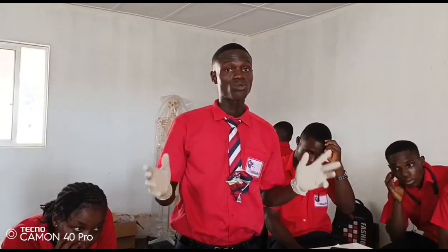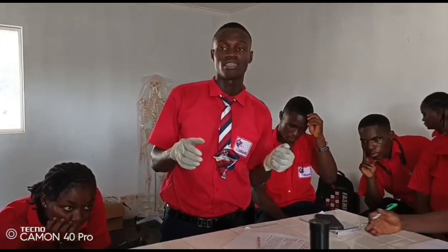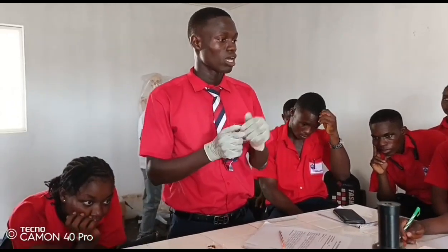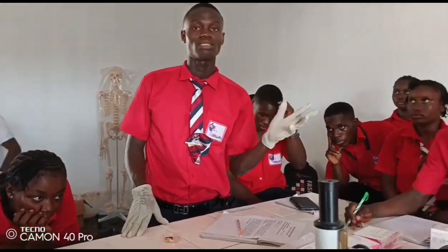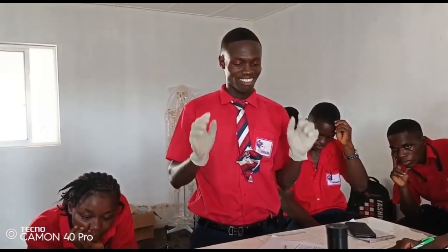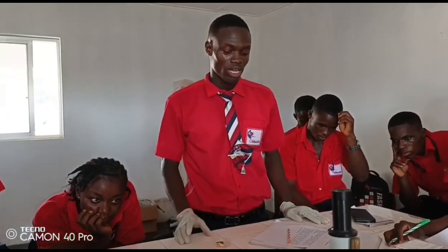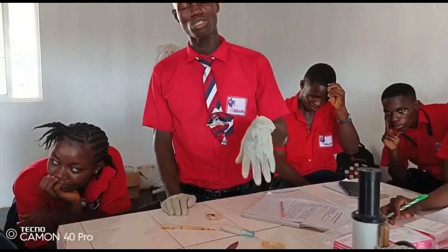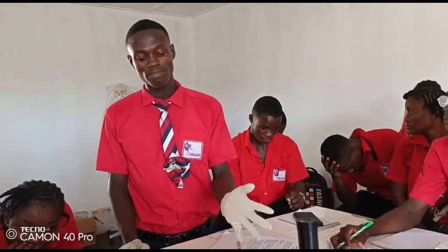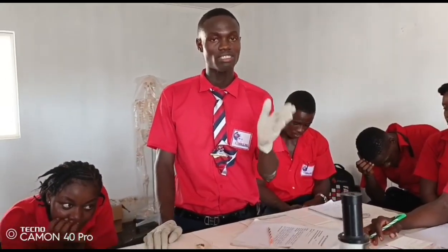My name is Prince Gabo, and today we are in the lab carrying out an experiment concerning fruits to see if they have starch or not. Our teachers told us to bring fruits and food as well, and we brought plantain and other food. Our teacher started the experiment with water, and he placed iodine in the water to see if water has starch or not. Water has no starch because the iodine maintained its brown color.